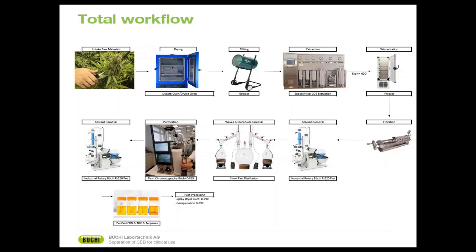This ethanol must be removed by using the rotary evaporator. And then we do the short path distillation, thin film or falling film distillation to remove the chlorophylls, lipids, and remaining waxes, even the terpenes if desired. After all those materials are removed, we will have a very clean cannabinoid oil mixture.